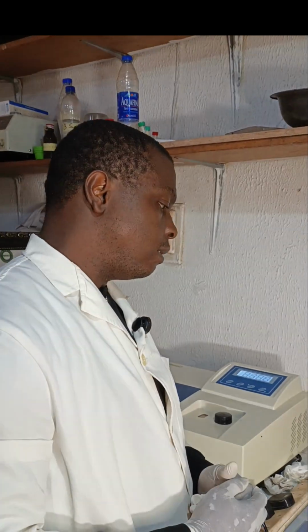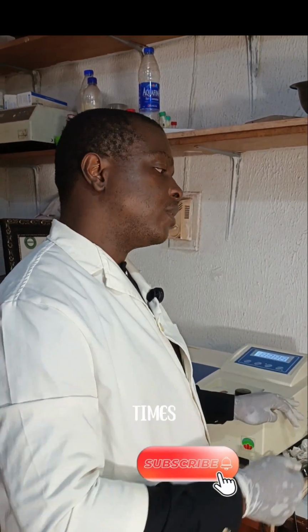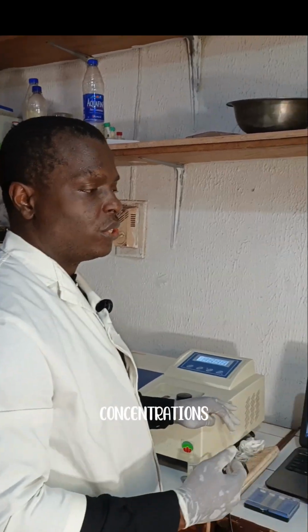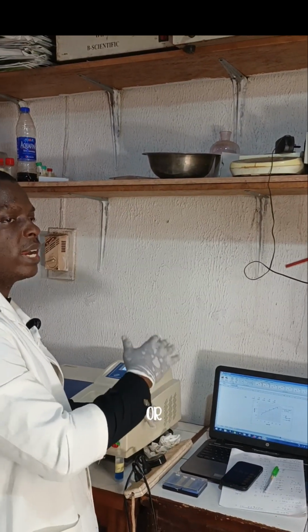So with this, we've been able to show how you can use a UV visible spectrophotometer to determine the concentration of a sample. Now, this UV visible spectrophotometer finds application in water analysis. As I've said earlier, it can be used to determine the concentration of nitrates, nitrites, and phosphates. But bear it in mind that at all times, before you work with a UV visible spectrophotometer, you must prepare standard solutions of known concentrations, which you use to standardize or calibrate the equipment.